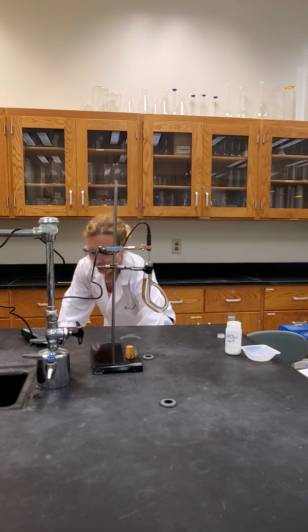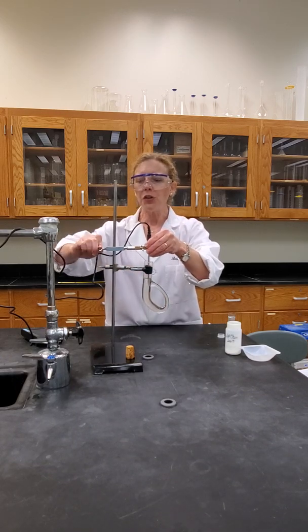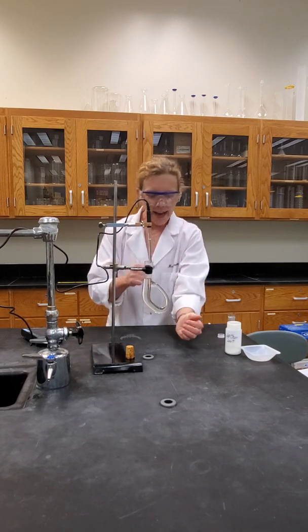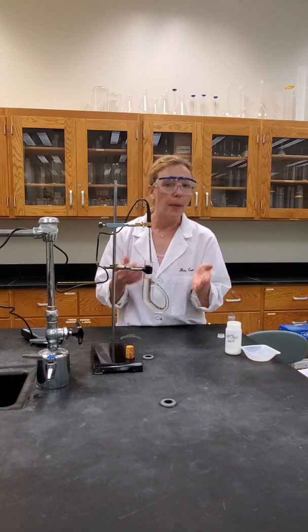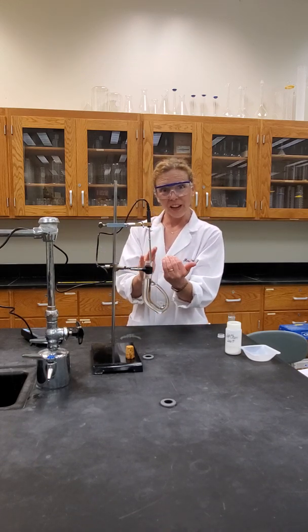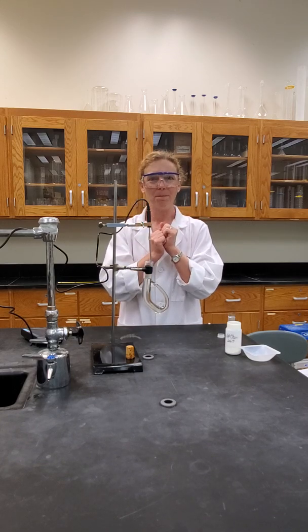All right, so between trials, do you have to get a new sample? No. All that you need to do is just raise this out of the oil, take away your heat, and allow the temperature to, well, you're gonna be taking the temperature of the air. So I'd give it a good couple of minutes. That will allow this to hopefully drop to a temperature below the temperature in the previous trial that you first started to see liquid.